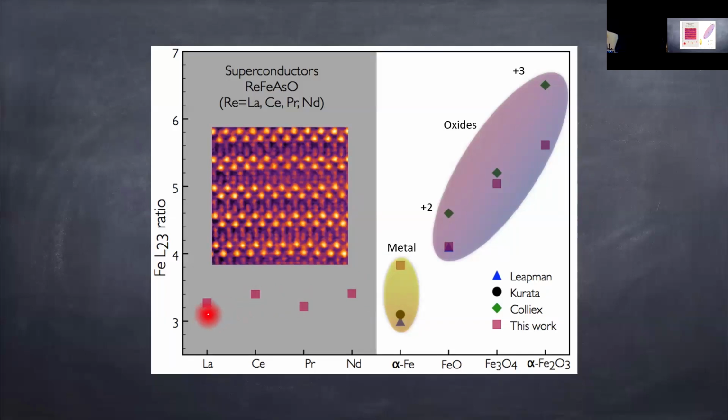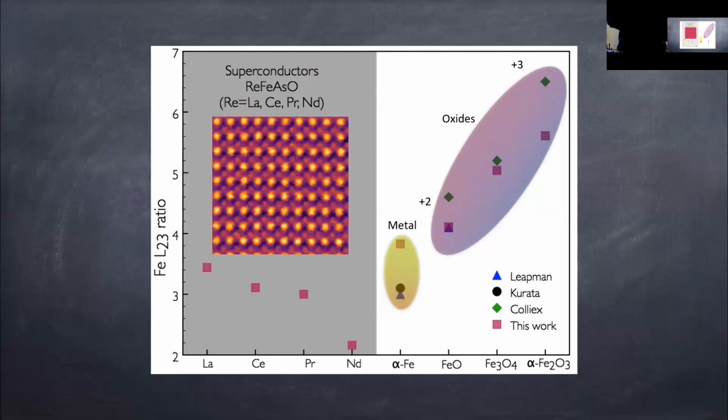And then for this crystallographic orientation, the oxidation state varies like that a little bit, but the ratio is smaller. Yeah, you will see in a moment. So the question is why the ratio is smaller in these materials with respect to the metal itself. But look at this. This is one crystallographic orientation. Now I can switch the crystallographic orientation. Right now I'm looking along 010, and now I'm going to look along 001, along the z-axis. And along the z-axis, the thing changes even more.